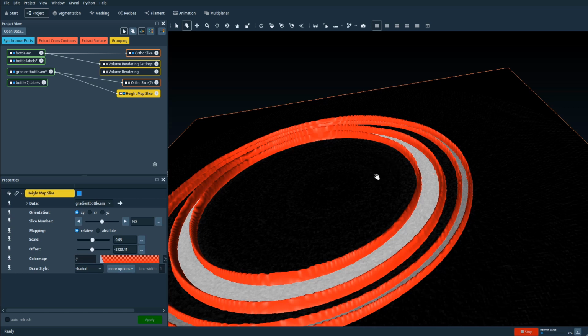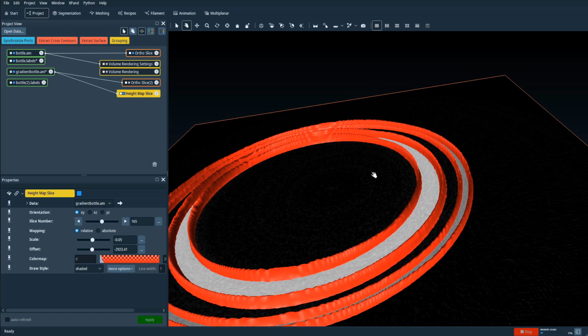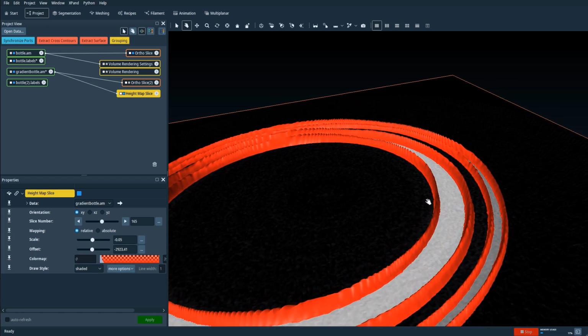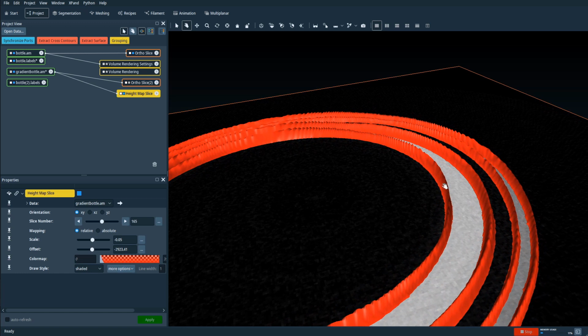And you just keep flooding this landscape until the water that corresponds to the material at some point will overflow. They will overflow and try to cross over this wall.